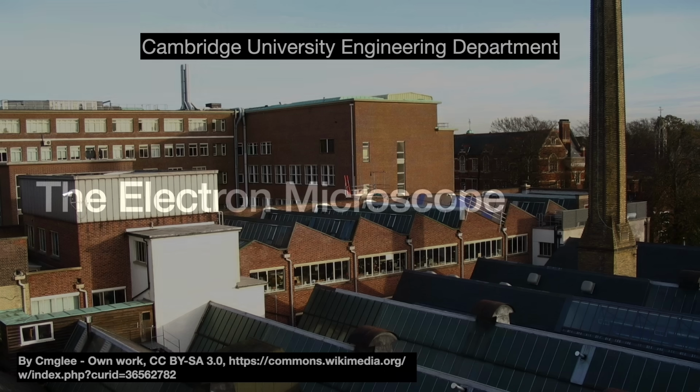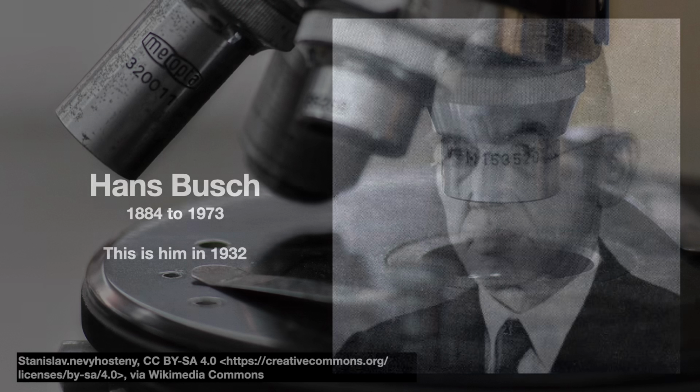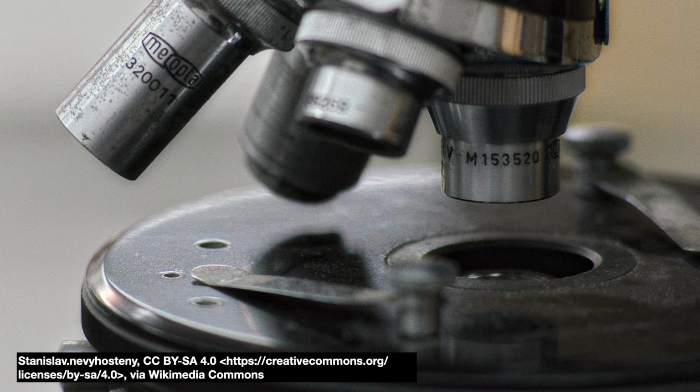In 1926, a German physicist named Hans Walter Hugo Busch showed that you can use magnetic and electric fields to guide the electrons of an electron beam in a certain direction. These principles enabled the possibility of a lens that can act on beams of electrons like how optical lenses act on visible light. Electron wavelengths are almost 5 orders of magnitude smaller than that of optical light. In theory, an electron-based microscope could produce resolutions far superior to that of optical microscopes.